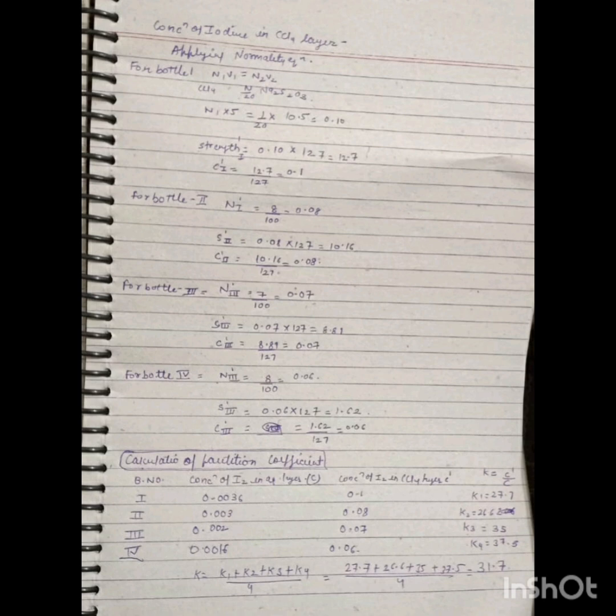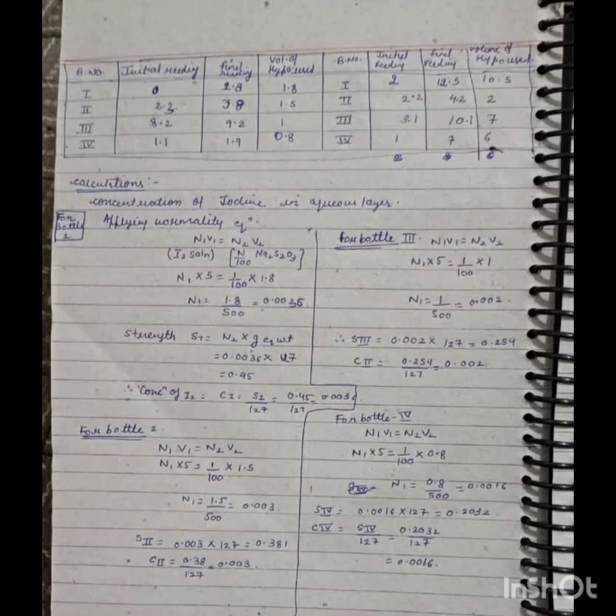Here concentration of iodine in CCl4 and aqueous layer is calculated, and hence partition coefficient can be calculated.